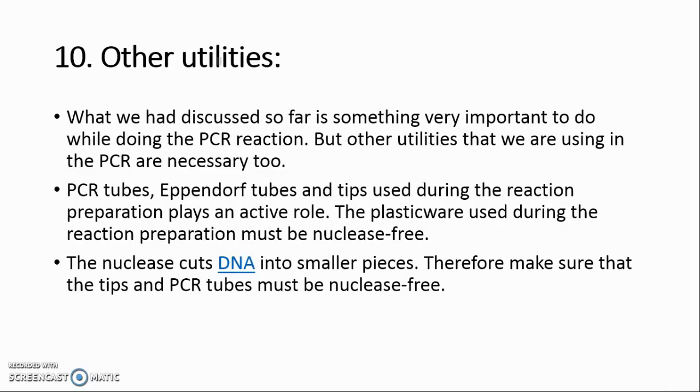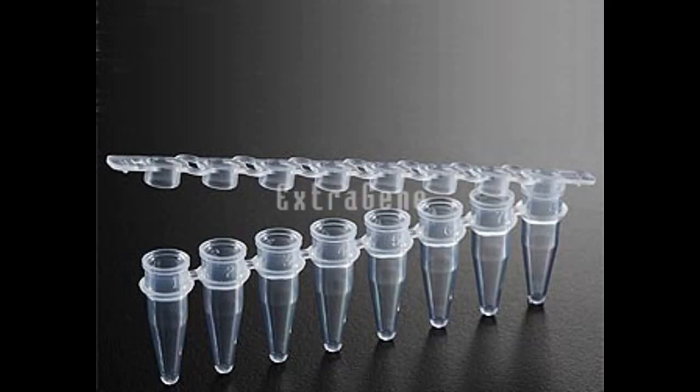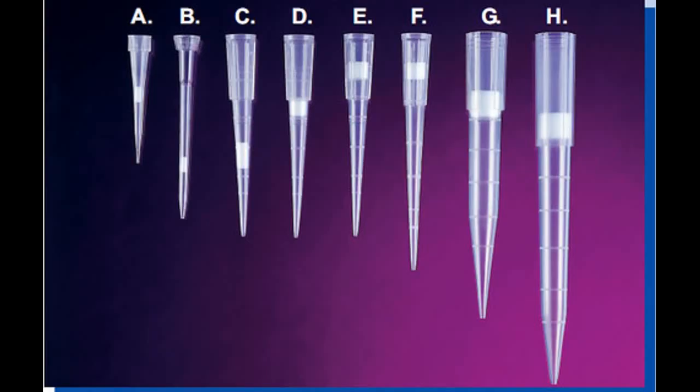Secret 10: Other Utilities. PCR tubes, Eppendorf tubes, and tips used during reaction preparation play an active role. The plastic ware used must be nuclease-free, since nucleases cut DNA into smaller pieces. Make sure that tips and PCR tubes are nuclease-free and sterile. If not, autoclave them before doing PCR, because foreign DNA present on them might be amplified and falsify results. Other contaminants such as traces of chemicals might hinder DNA synthesis, so keep all utilities clean before preparing the PCR reaction.